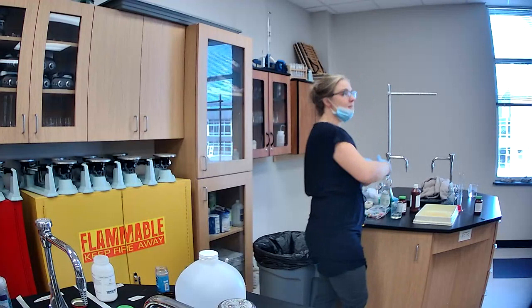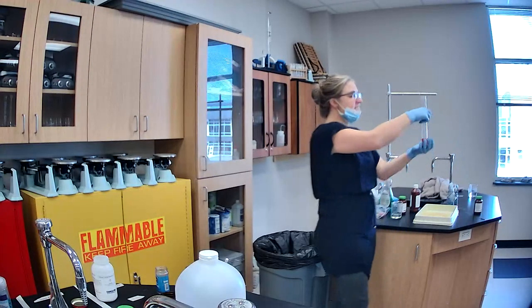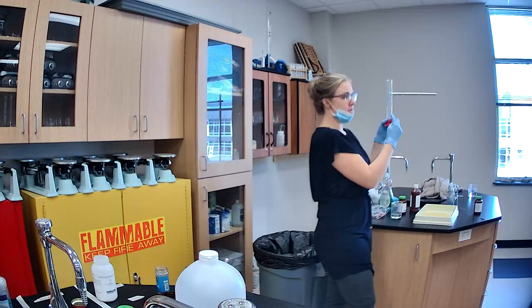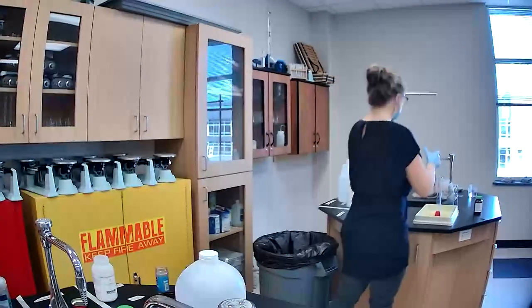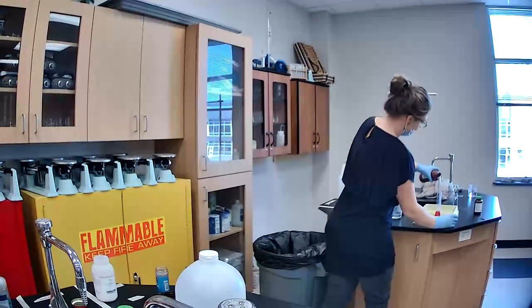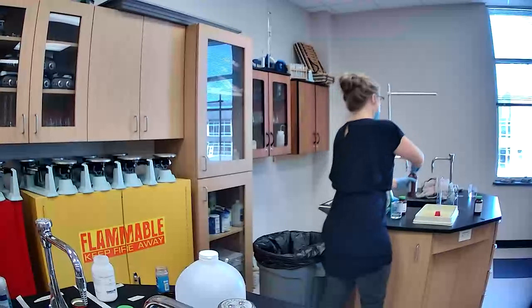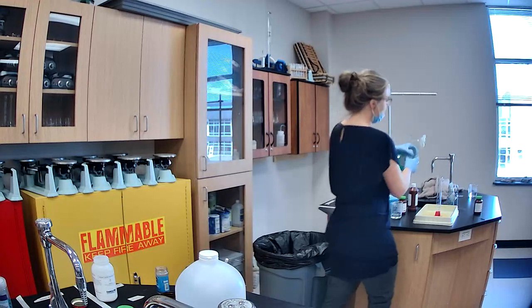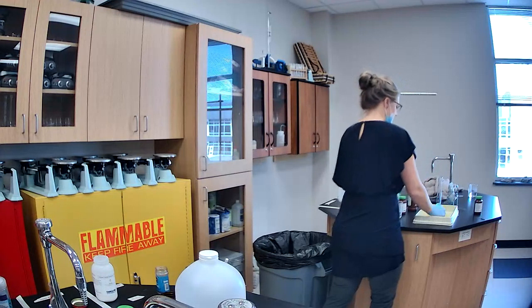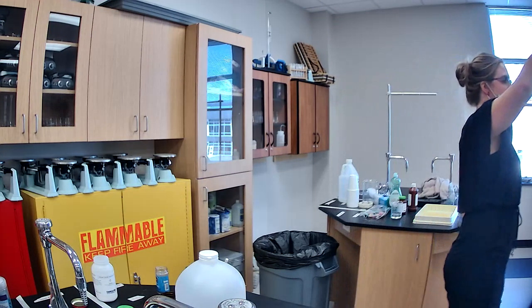All right, so here's my graduated cylinder. I'm going to fill it with hydrogen peroxide up to 30 milliliters. Okay, 30 milliliters. Now I'm going to add a squirt of soap. Now notice how the soap sits on top of the hydrogen peroxide.